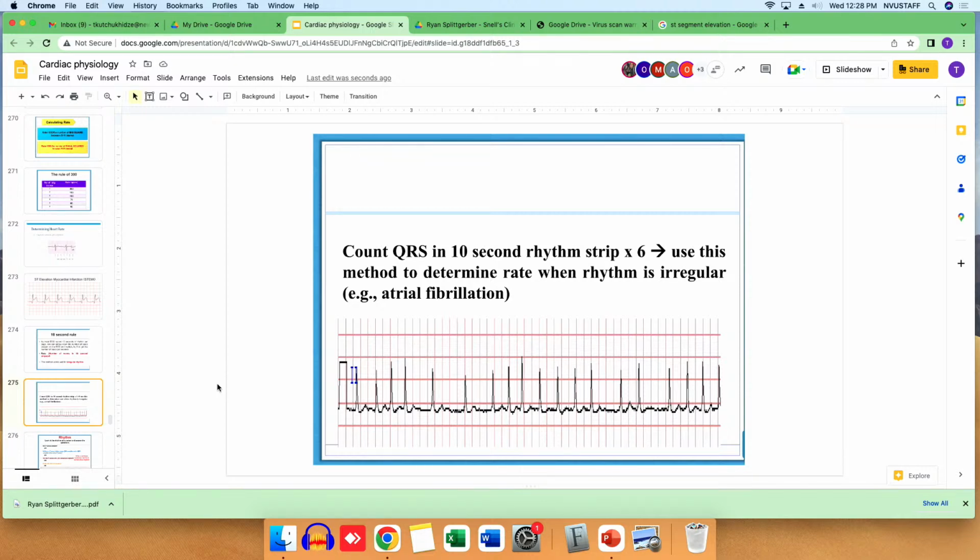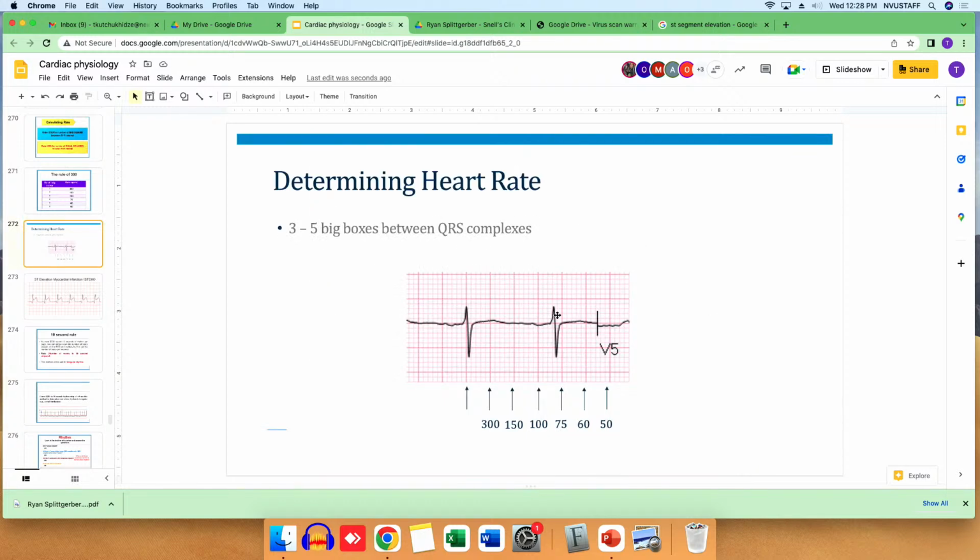Mostly, if it is closer to the end, we are counting it as one whole. For example, here, see, it is not in the middle. If it would be around here, we would count it as a half. Here we will count plus 4. 1, 2, 3, and 4. I will count it as a 4. If it is directly in the middle, which normally it won't be, it depends on you. Then we're choosing not this quadrant, but another one, okay?